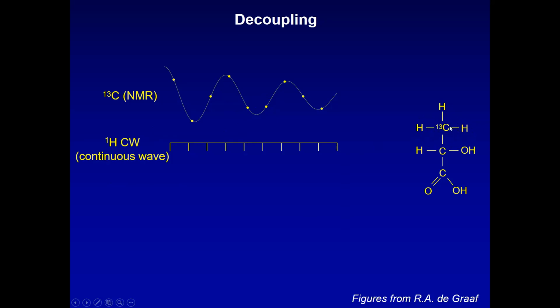The effect is to prevent them from settling into an up or a down influence on the carbon-13. They end up averaged, with an average orientation in the middle, neither up nor down. And so the carbon-13 spectrum ends up giving us just one peak.